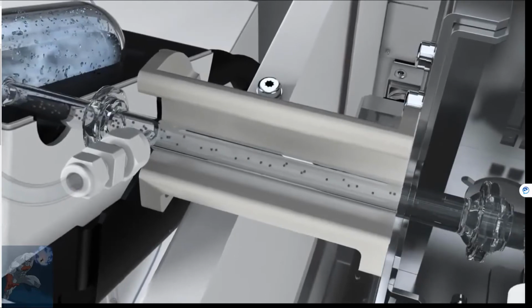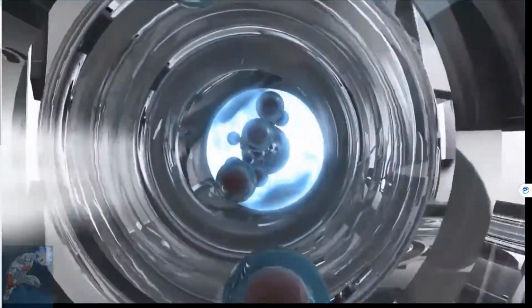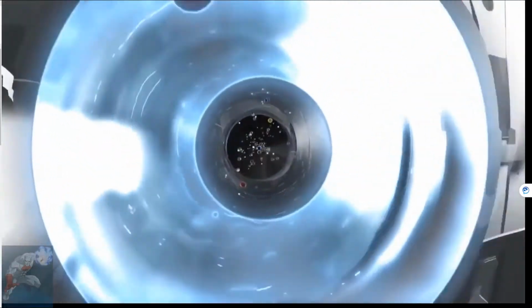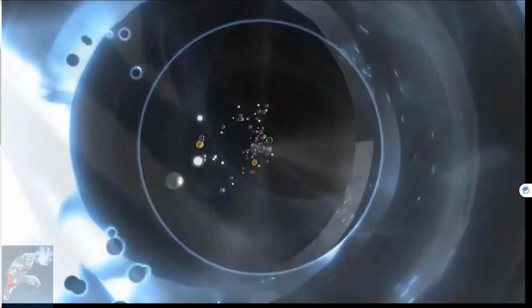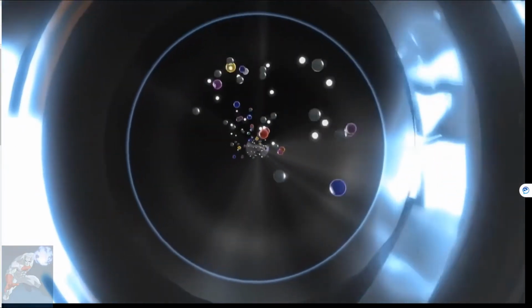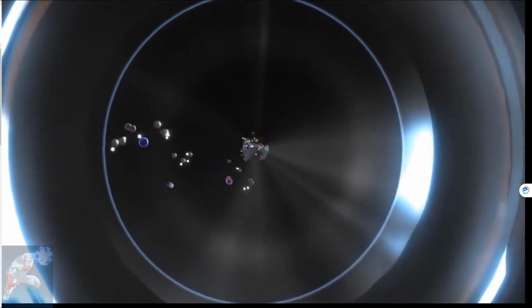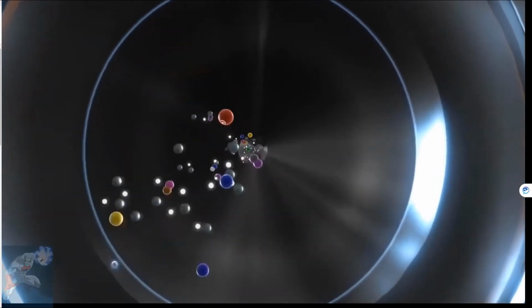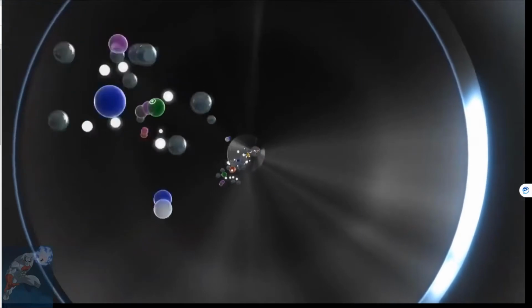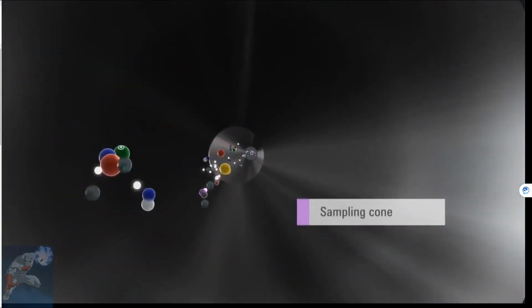As the fine droplets enter the plasma torch, the high temperature and energy quickly desolvate, vaporize, atomize, and finally ionize the sample. This stream of neutrals, stray light, and ions now passes through a series of cones, separating the vacuum area from the torch area.